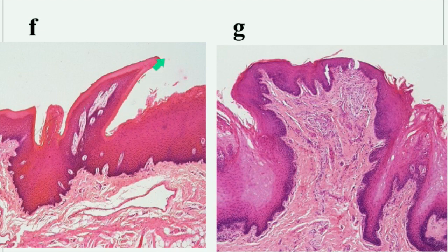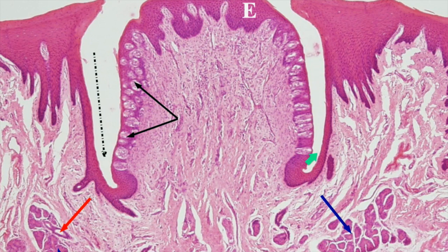A picture shows both filiform and fungiform papillae together: filiform papillae are conical, keratinized, and have no taste buds; fungiform papillae have a mushroom shape with a broad apex and a narrow base, are highly vascular with many blood vessels visible, and the basement membrane is corrugated. The fungiform papillae have no surrounding groove and contain only a few taste buds. Here the circumvallate papillae are very evident by the grooves and numerous taste buds, with the von Ebner serous glands opening into the surrounding valley or groove.